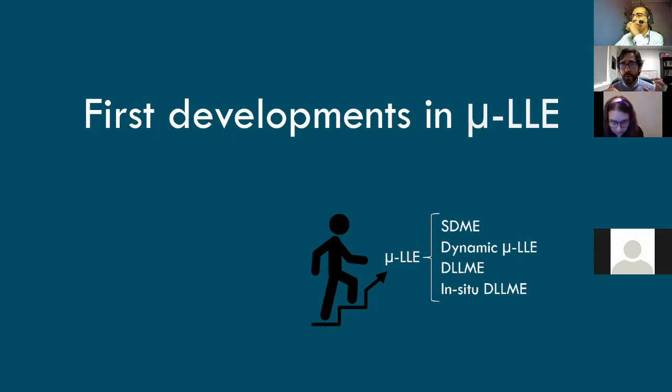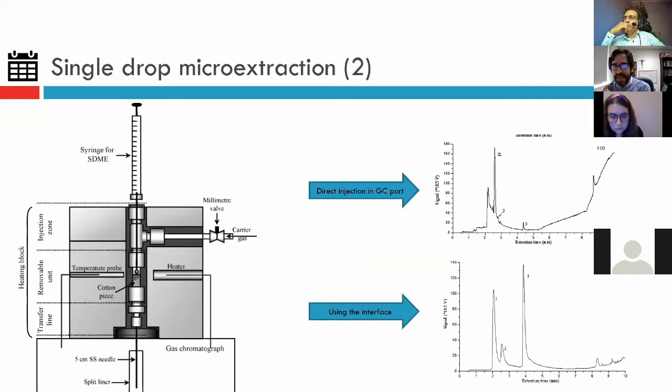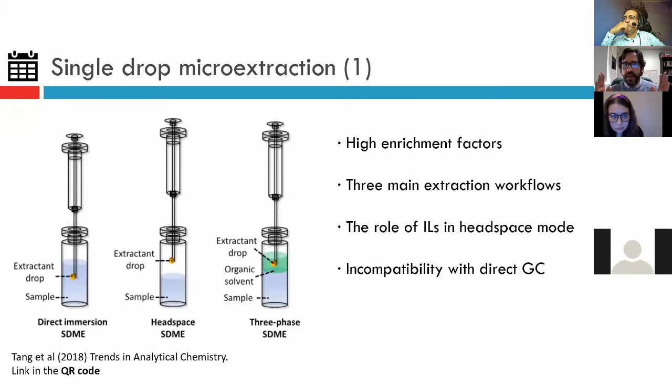So in the micro liquid-liquid extraction, we have checked different techniques: the single drop microextraction technique, the dynamic micro liquid-liquid extraction, the dispersive liquid-liquid microextraction, and the in situ solvent formation dispersive liquid-liquid microextraction. So, as a brief summary, let's check our developments in single drop microextraction.